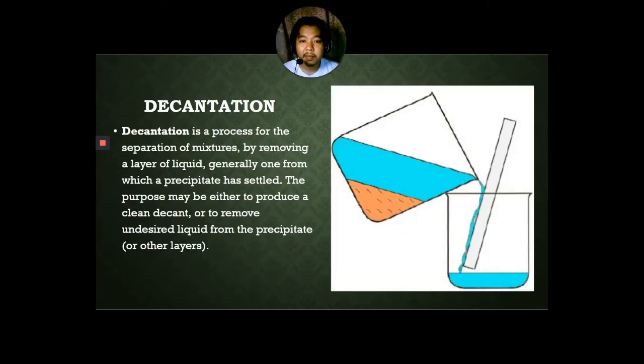So the next example of a physical separation technique is decantation. What do we mean by decantation? This is a faster way of separating an insoluble solid from a solvent. It is different from filtration. Why? The insoluble here is actually medium or large in size, so we have a bigger residue, if you might call it that. Filtration is what we use when the insoluble particles are small, because some would slip through if we used the decantation technique.